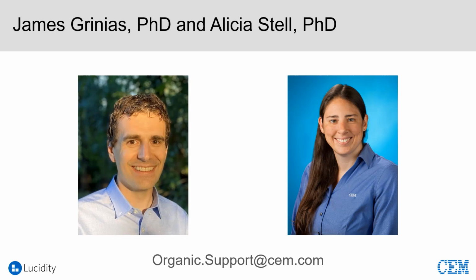Great, thank you for the question. So a lot of what we talked about today in terms of these allowable or acceptable changes focused on isocratic methods. And I think you maybe saw, if you look at some of the slides that mention mobile phase, that changes are acceptable for isocratic methods, but it usually says no or in part for gradient methods. I will note that there are some changes coming to the USP, especially Chapter 621, that relate to how you can adapt and transfer gradient methods. So there will be some more coming out from the regulatory side sometime soon.